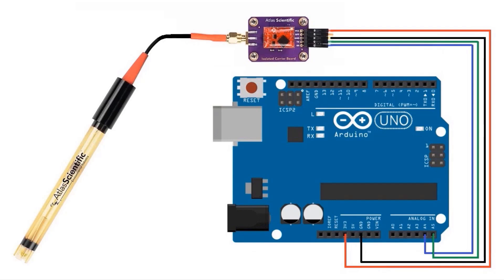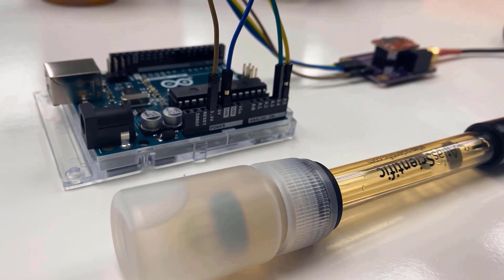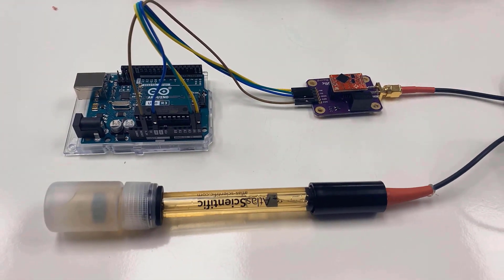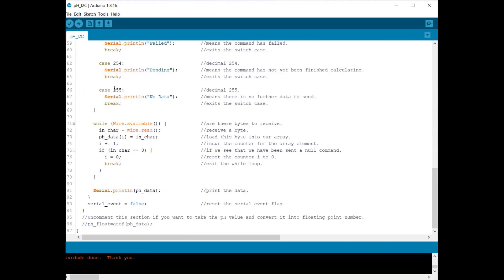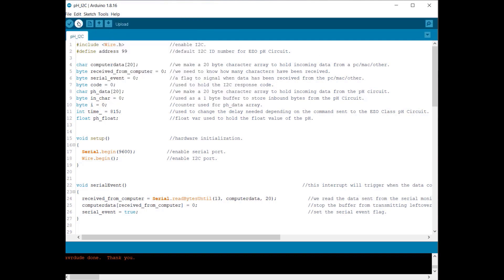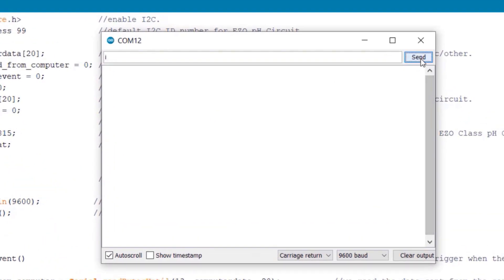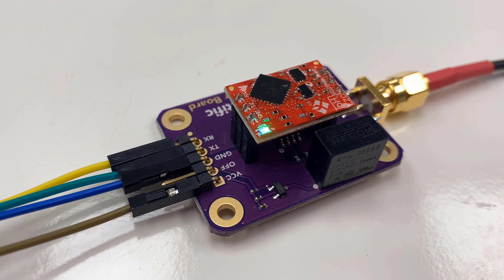The previous wiring will not work for I2C now. Remove the TX/RX wires and connect to A4 and A5 of the Arduino board — A4 is connected to SDA and A5 to SCL. Here is a sample sketch for this; assign the I2C address to the sensor, select the board and port, then upload. Open the serial monitor — this code can be used to switch the sensor mode back from I2C to UART. Type 'I' and send; a success message will appear. Then type 'BAUD,9600' and hit send — the LED color will change back to green.